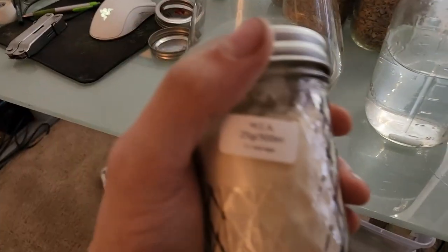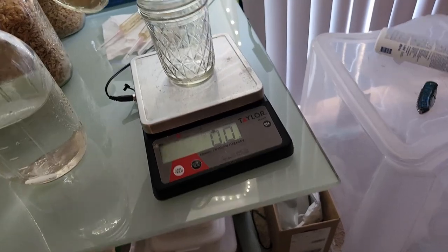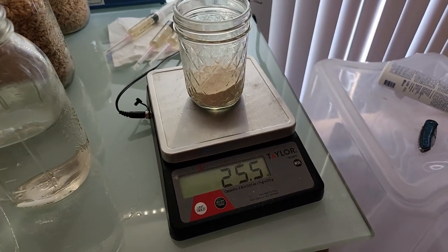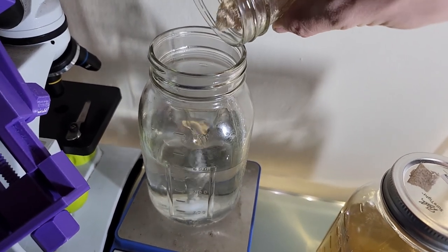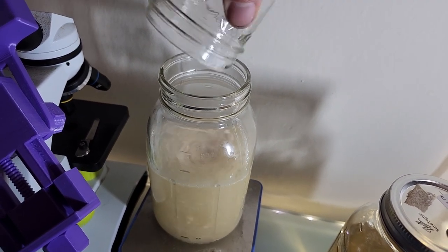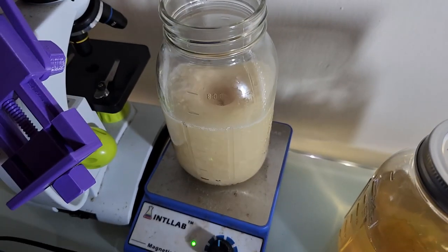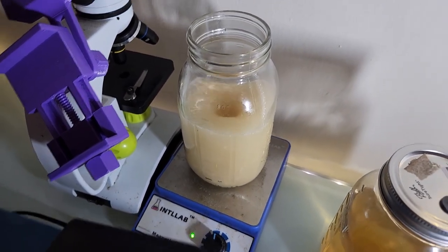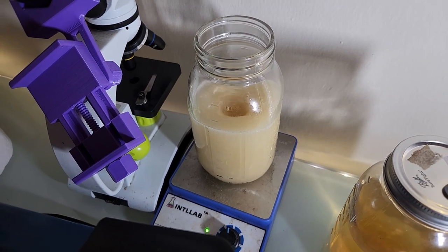Next, you want to weigh out 25 grams of malt extract. Now, once you have 25 grams weighed out, the way I like to mix it in is put it on my stir plate. Get it going. Pour it in. And this helps reduce some clumping. And this is also why we start with cold water, because if you start with hot water, it will all clump together and suck. So I'm just gonna let that stir up, and then we're gonna melt it down.